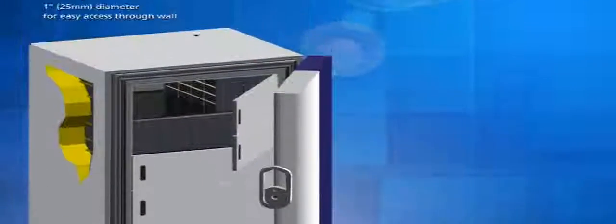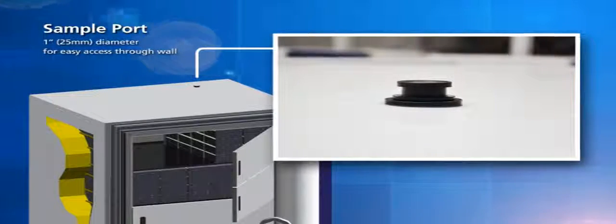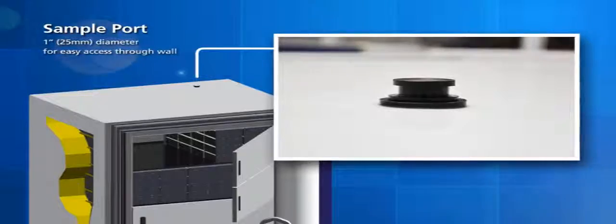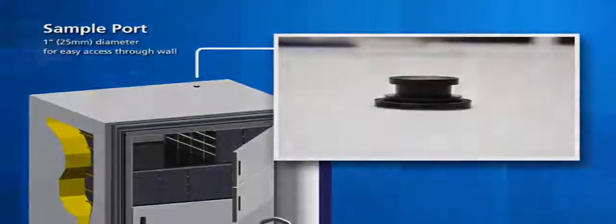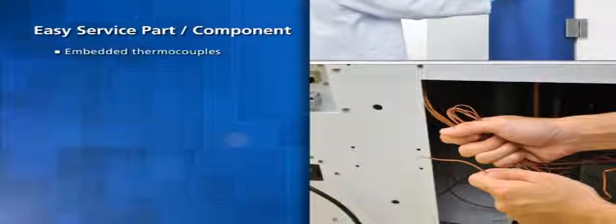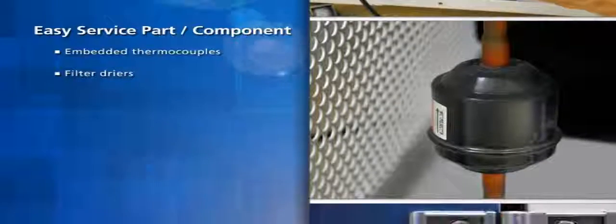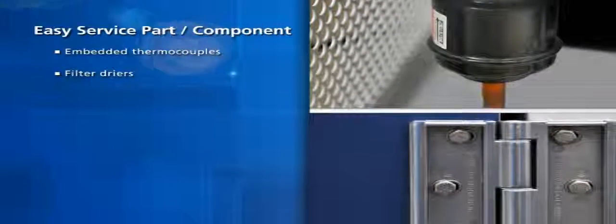The access port located on top of the freezer provides easy installation of carbon dioxide and liquid nitrogen gas backup system. Embedded thermocouples are incorporated in the foam for easy field troubleshooting. Filter dryers are located at the back for easy replacement.